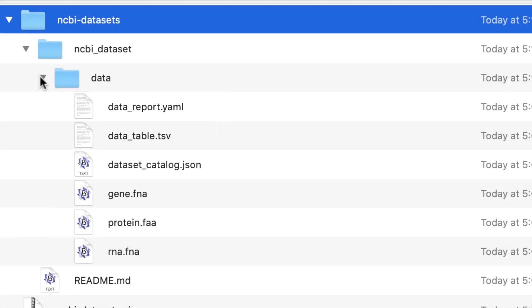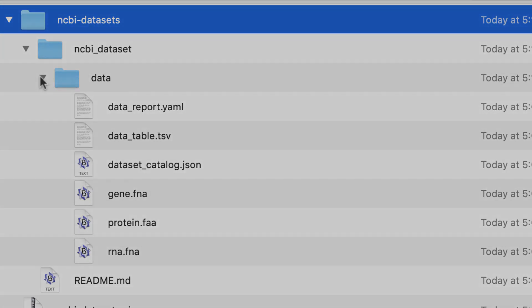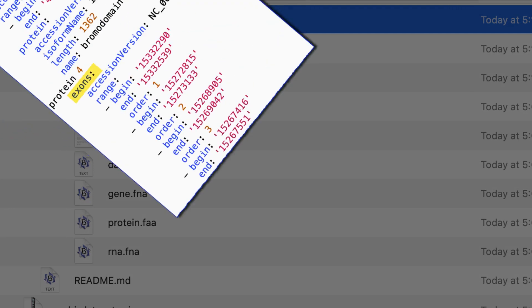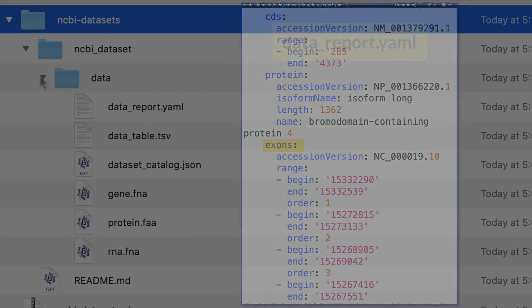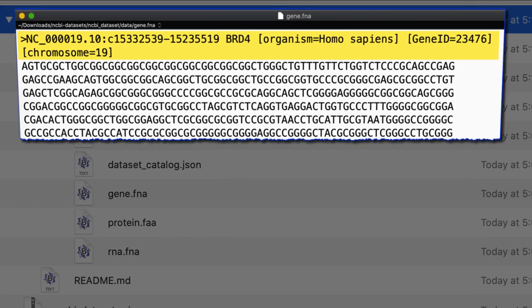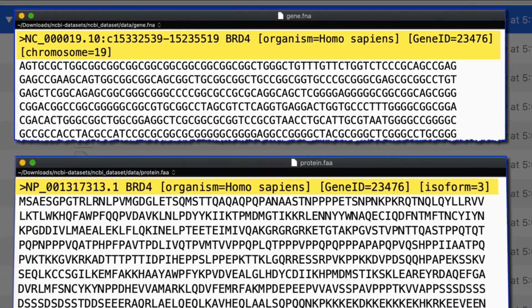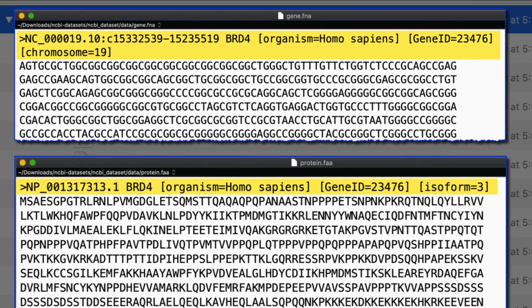The data table is tab-delimited and opens readily in Excel, and the data report file contains annotation including the genomic ranges for all exons. The files for genomic, transcript, and protein sequence have informative FASTA headers that allow unambiguous identification of the data.